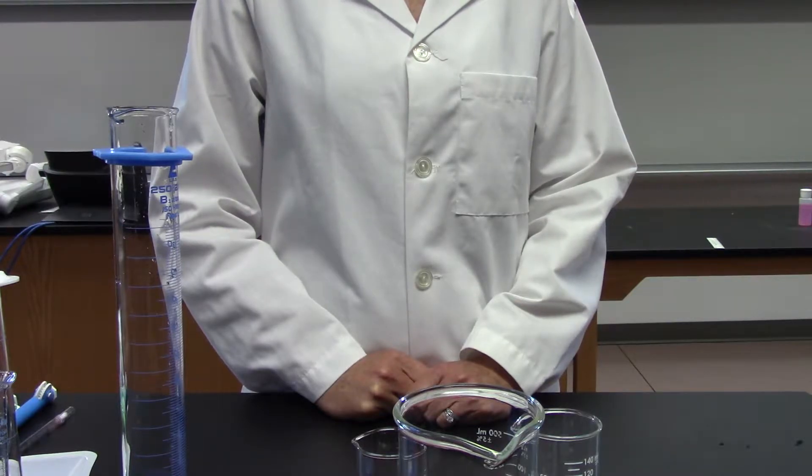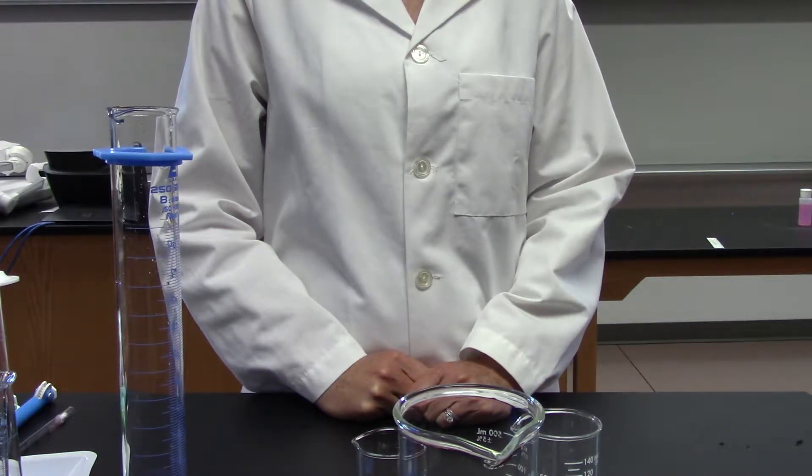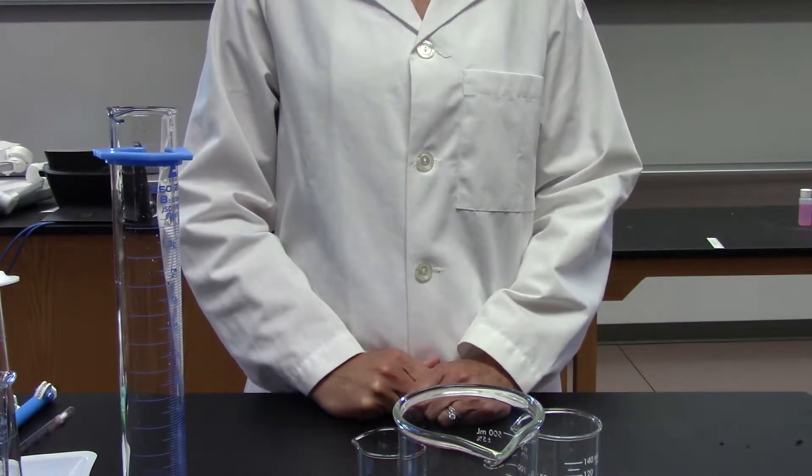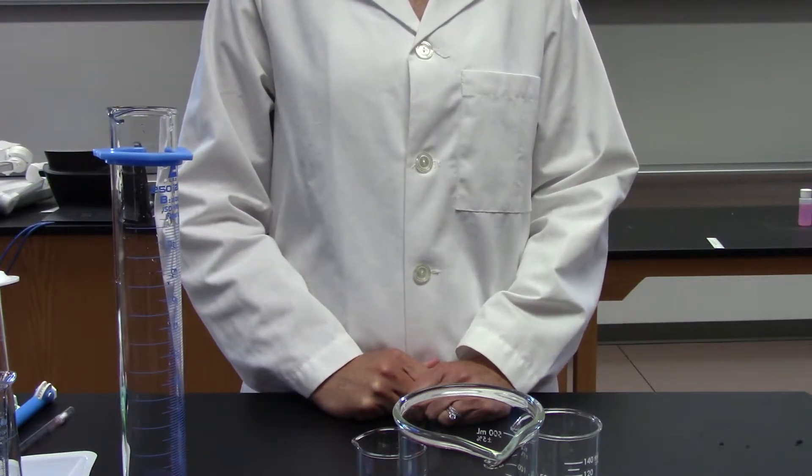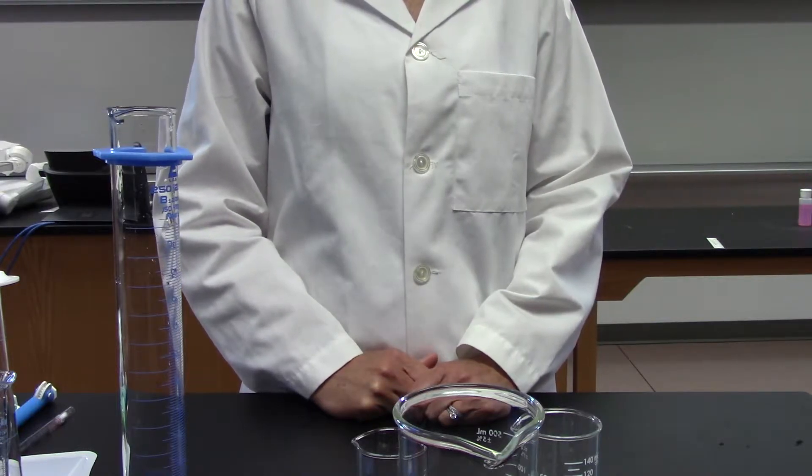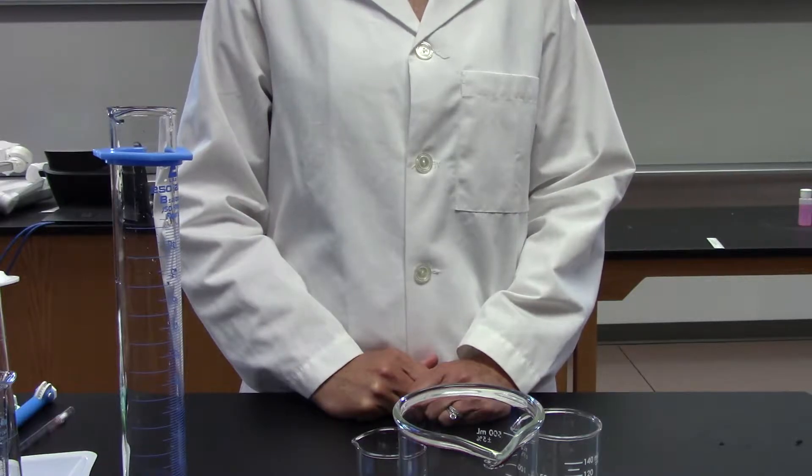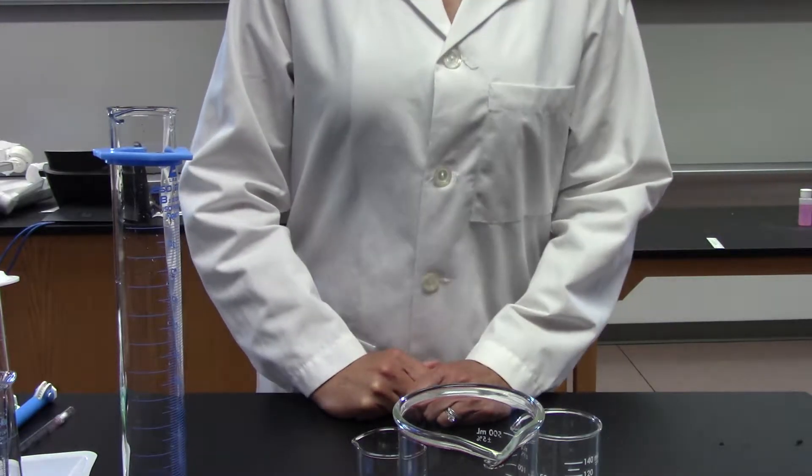You'll be measuring liquid volume using liters as the standard unit, measuring weight or mass using grams, measuring length using meters, and temperature in Celsius.